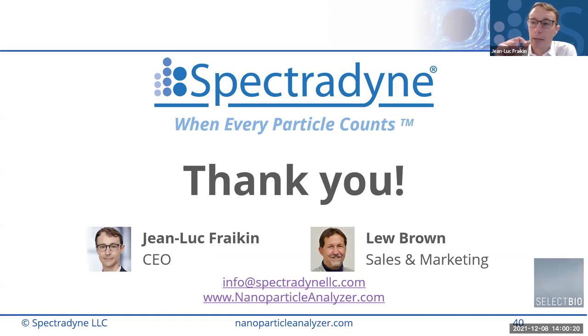The last question I had, but I forgot now. Lou, do you remember? Volume of them. Oh, the volume, yeah. Of the sample. Thanks. Yeah, so the minimum volume of sample required at the final measured concentration is just 3 microliters. Dr. Sultana is on the line. I saw her. She has used the NCS1 to measure tick saliva. So you can imagine how small a volume that is.